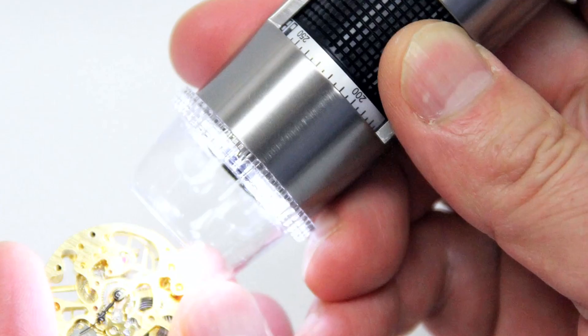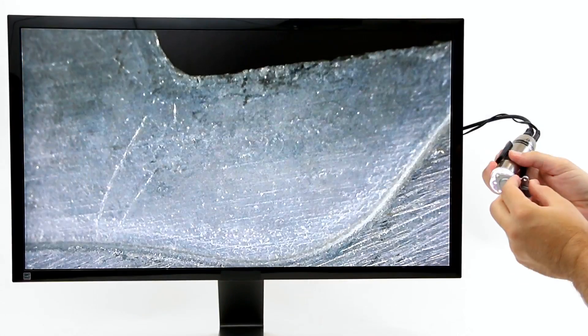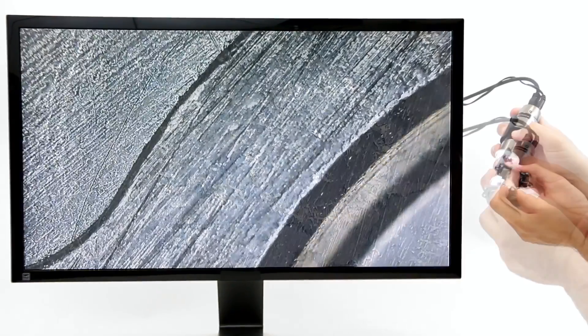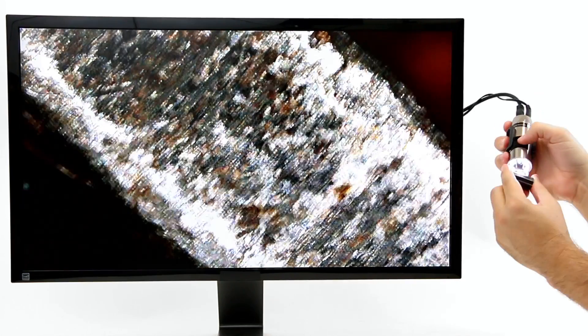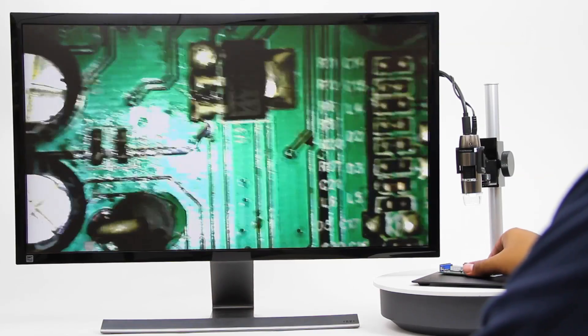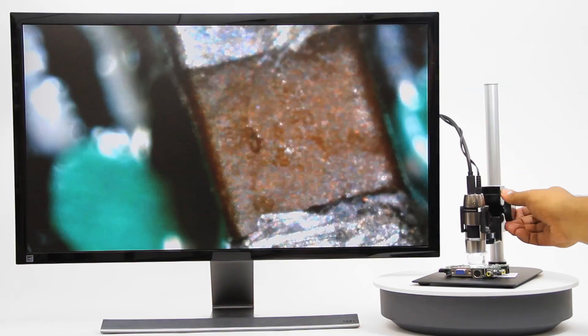Introducing the Dynolite AM5018MZT and AM5018MZTL microscope cameras, designed for real-time viewing on high-definition TVs. These live viewing models are recommended for inspection or repair work with detailed views.